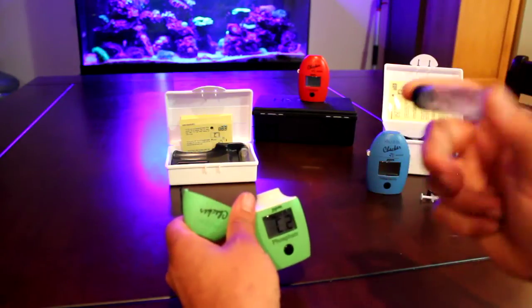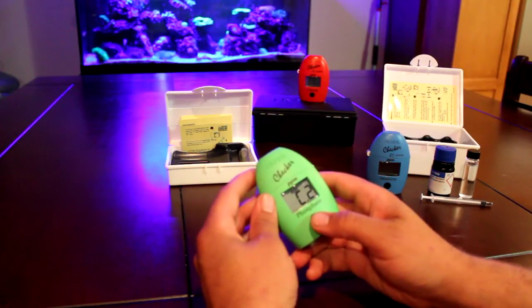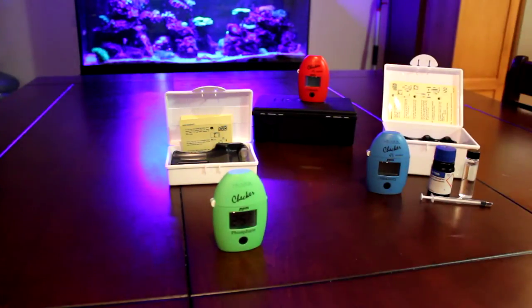Pretty much done. Make sure there's no air bubbles. This time we're going to hold the button down, the 3-minute timer comes on the clock, and leave it.